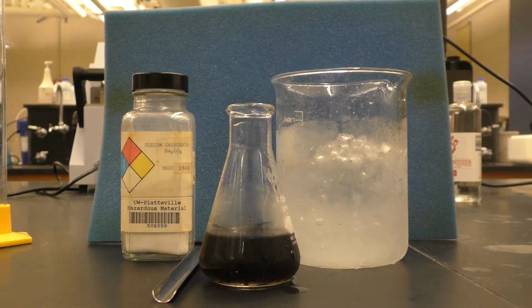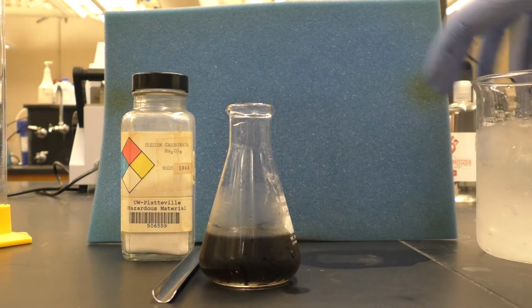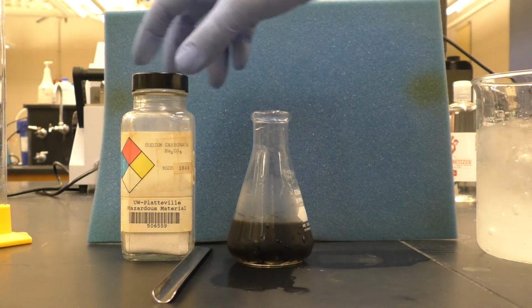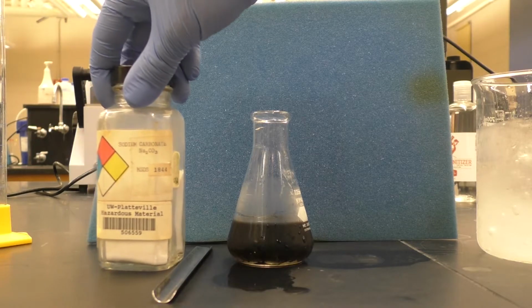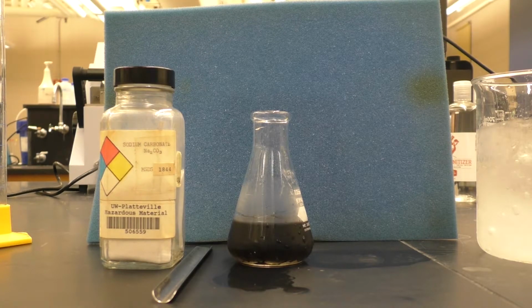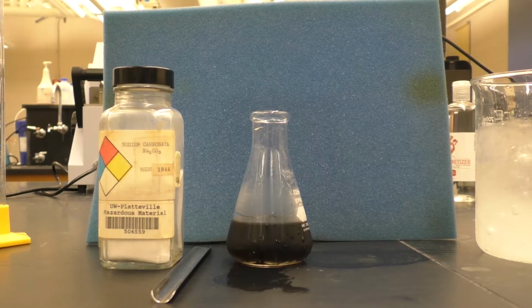Really, the reason the material is still staying in solution is because some of it's protonated, and because it's protonated and charged, it is still soluble in the aqueous environment. And so we're going to use, very carefully, some sodium carbonate here to deprotonate that amine product, or the amide product, actually, and result in a material that should precipitate out of solution.